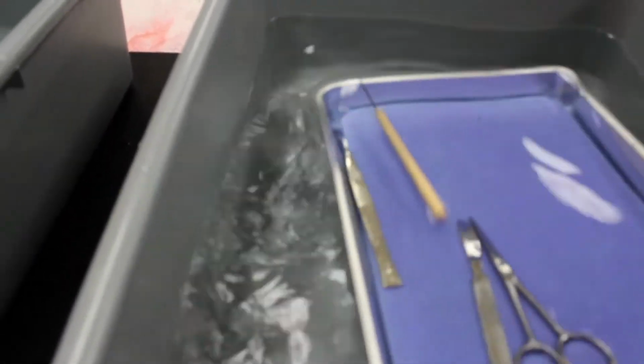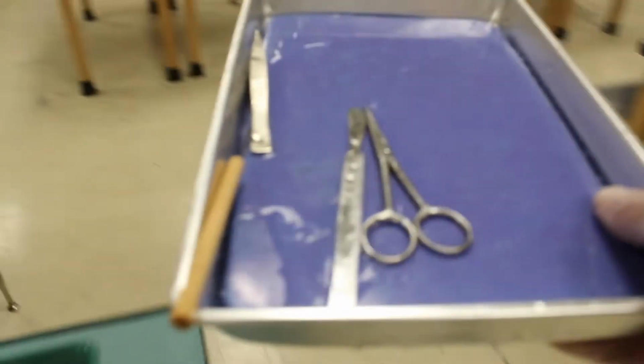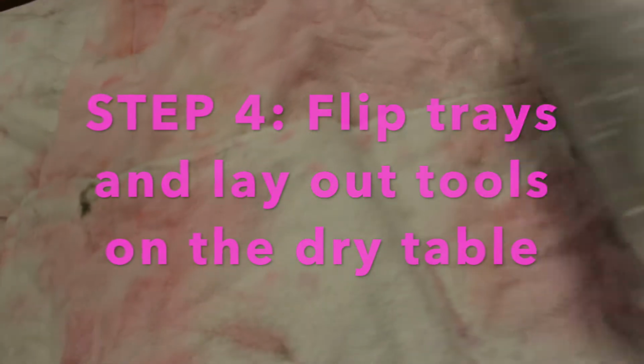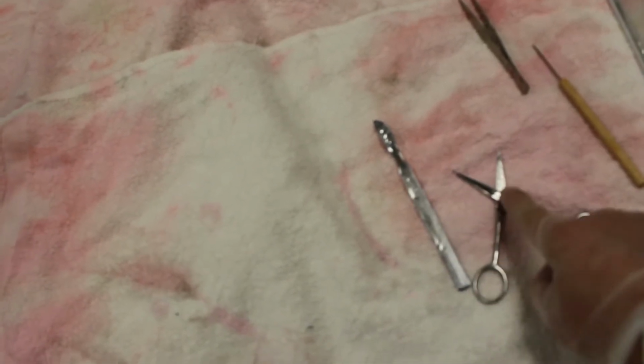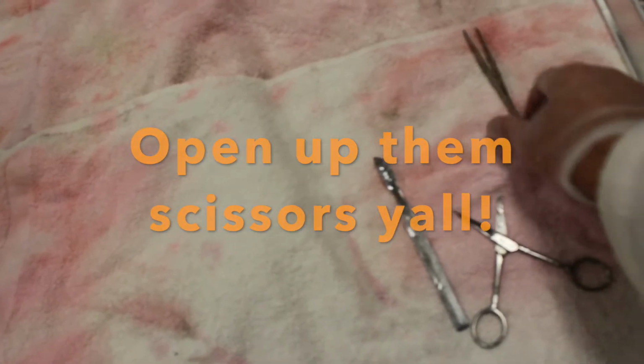We can take off the pads. So drain it, drain it, drain it. And then we need to put it over here to dry. So on the other side, we have our dry table. So you're going to flip it so everything empties out. All the tools, you're just going to lay out so they dry. Open up your scissors because it'll get rust along the inside if we don't. And that helps them dry a little faster.